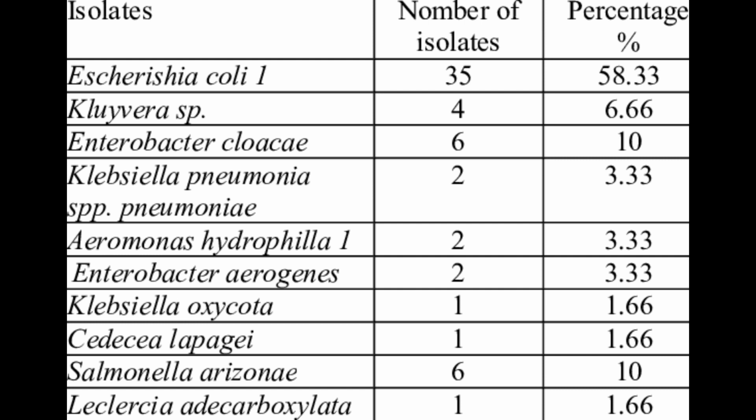Now, let's discuss the opportunistic coliform enteric pathogens. Under the genus Escherichia, we have Escherichia coli, the predominant facultatively anaerobic species in the large intestines of man, and an index of fecal contamination in water bacteriology. On EMB it shows a greenish metallic sheen, and on MacConkey agar, flat, dry pink colonies.